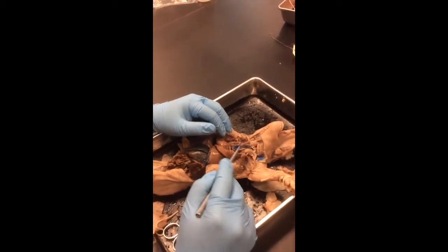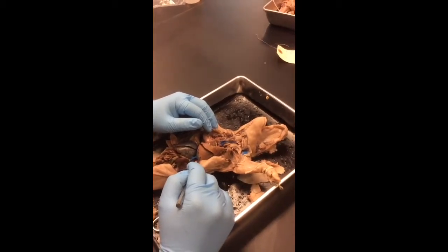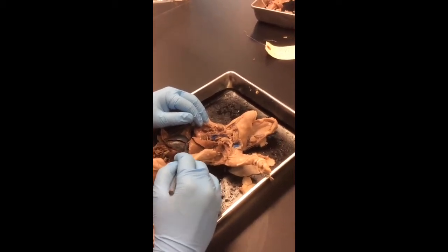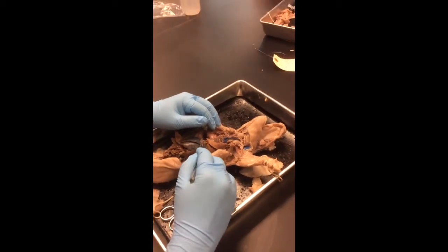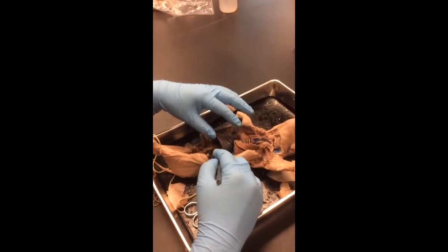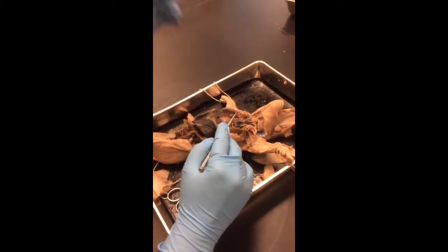Hepatic portal vein. You don't need to know the hepatic portal vein on the pig, but you need to know it for the written part. Know what it does, right? It's a vein that doesn't bring blood back to the heart. It connects to organs. And the hepatic one specifically connects parts of the digestive system to it. So learn that. The small intestine, the stomach, they have veins back to the liver, called the hepatic portal veins. Ductus venosus, we just mentioned.